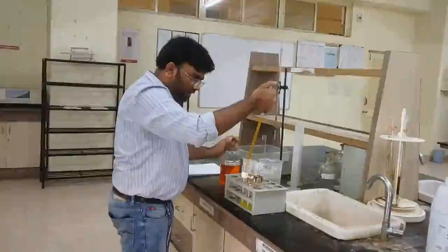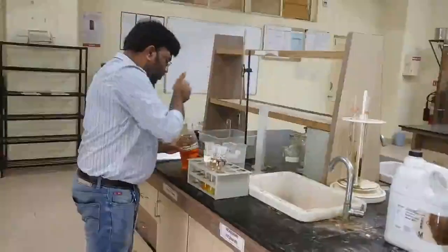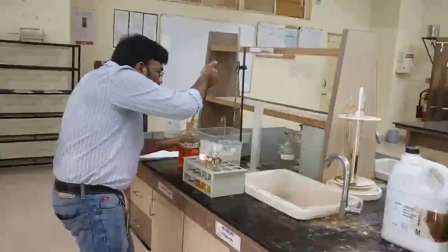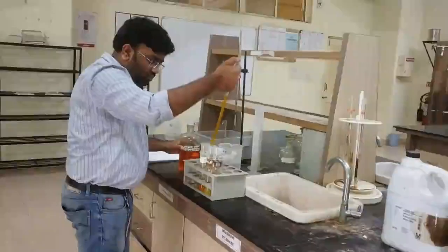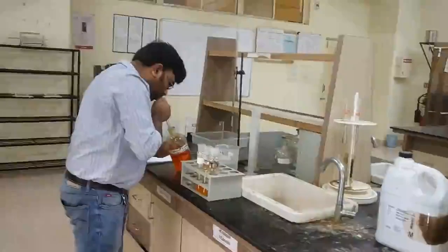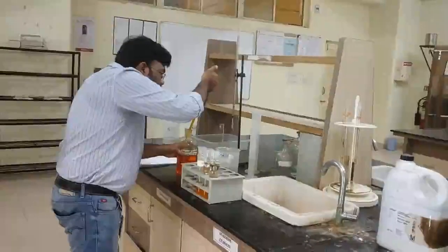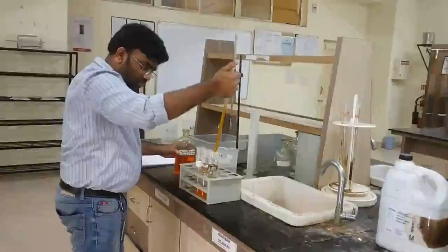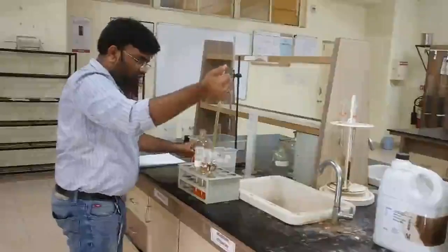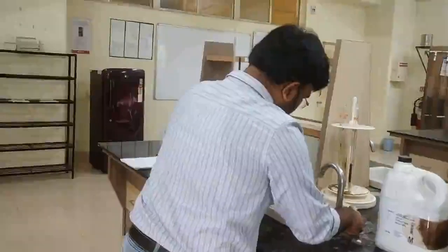This was the blank. So we have added 0.25 normal K2Cr2O7.